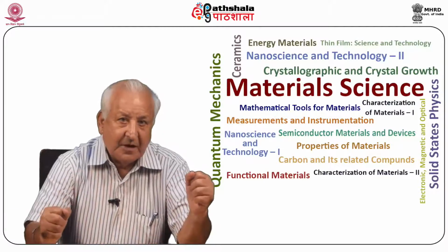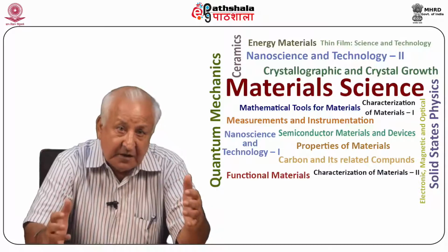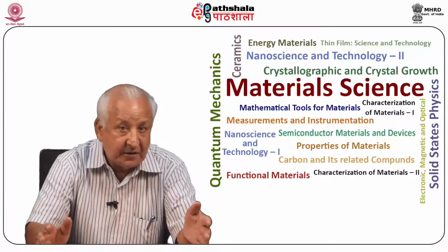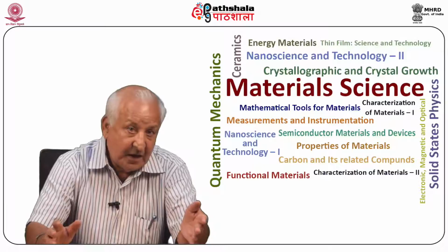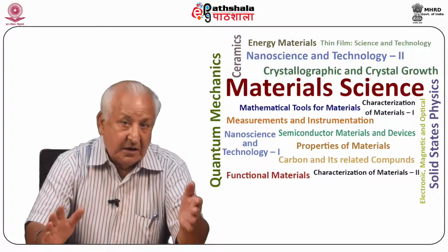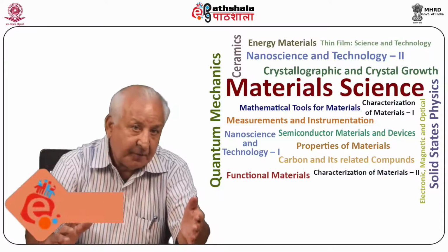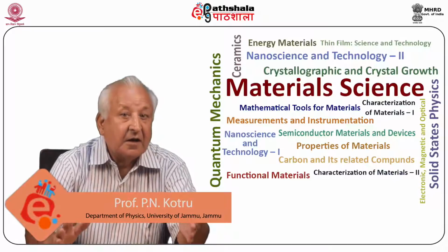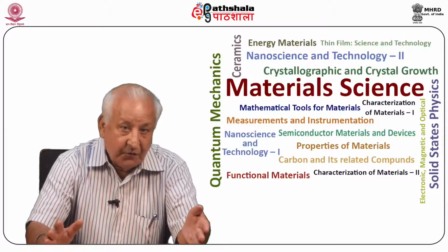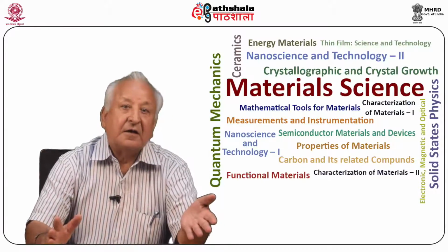So, students, let us now summarize what we have learned in this module. We have learned about the experimental techniques of X-ray diffraction for the assessment of defects in crystals, which have been described and discussed. The techniques of Berg-Barrett, also known as Newkirk, in symmetric and asymmetric Bragg reflection, have been described and explained. The Lang technique of X-ray topography is also discussed. Examples of topographs and diffraction curves which reveal defects of some crystals are given and explained with full description.